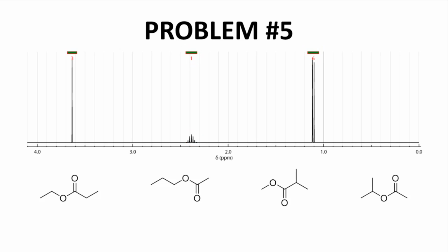So our first structure has, let's label the number of different signals we'll have. That's a CH3, a CH2, a CH2, and a CH3. We only have 2 CH3s, so it looks like we are not. This has 2 methyls. This doesn't look that encouraging. Okay, let's look at the next structure. We should have A, B, C, D. And there's a methyl, and there's a methyl. Otherwise, we just have CH2s. This looks like 2 methyls. This is probably not our structure.